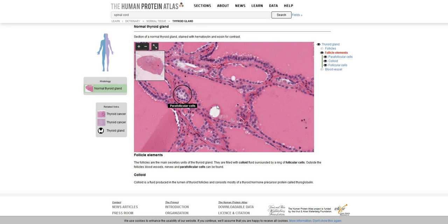So they're really important for maintaining homeostasis, maintaining weight in the body. So sometimes when people have thyroid issues, they can either gain or lose weight really rapidly. So we definitely want to keep a handle on that with T3 and T4 regulation. Those hormones are stored in the colloid. So they're stored in this fluid-filled pink space in the middle of the follicle.